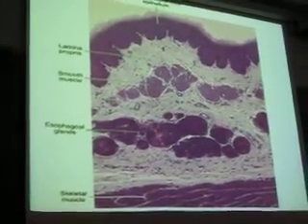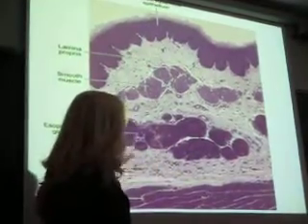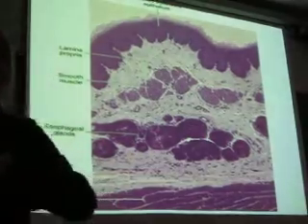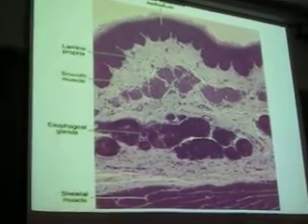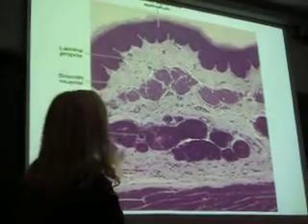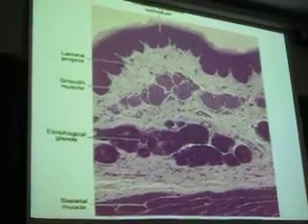Not all parts of the esophagus are as dense, though, in these esophageal glands. And in fact, in this slide, those don't even look like glands at all, do they? They almost look like lymphatic tissue that you might see in the small intestine, right? But these two things are definite indicators as to where in the digestive tract a section has been taken.